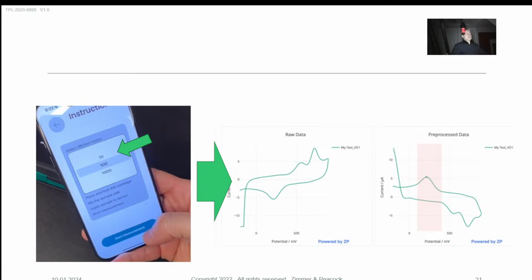But I said it earlier on, when you're running the assay, the front of the machine will flash a green LED. That tells you the assay is running. At the end of the assay, the data goes to the cloud. Now that data is saved behind your username and password, so I can't see it, but you can choose to share it with me. In this particular case, they're going to, because I know the guy very well, he's going to end up sharing it with me, so I know what I'm looking for.